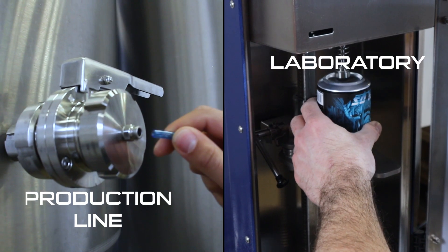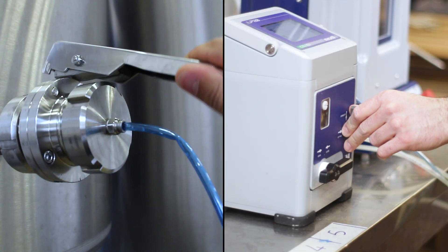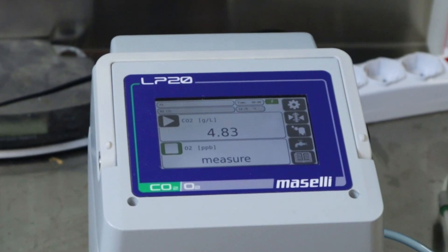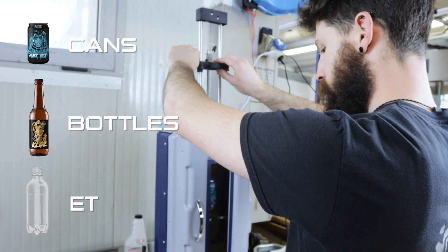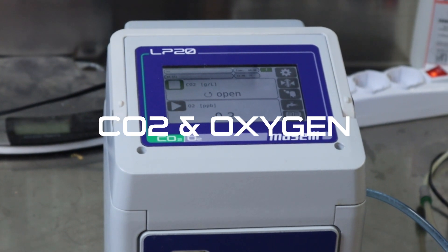With its portability features, the LP20 can be used either in the laboratory or on the production line. With its easy connection to the Macelab automatic sampler SL01, it can also be used in the laboratory. Whether in the laboratory or at the production line, the LP20 can handle any type of container, including cans, bottles, and PET.